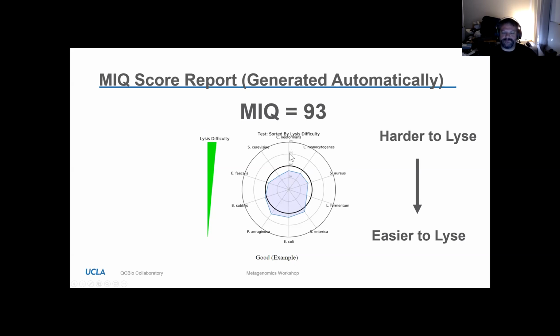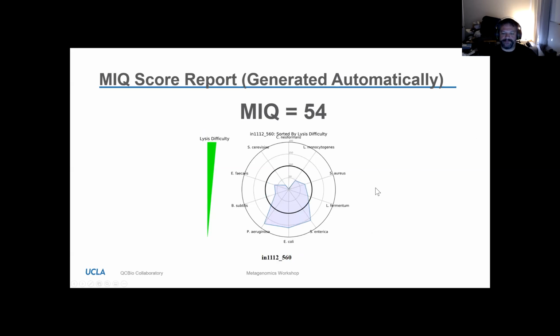So something at this line would be seen about 1.5 times expected. Out here, we're seeing double the expected relative abundance of it. Something that we just missed entirely is going to look like a big missing wedge from the pie. So again, this one, it's pretty well centered. This one, it's not well centered anymore. In fact, what we see now is a big shift downward with a piece missing right here.